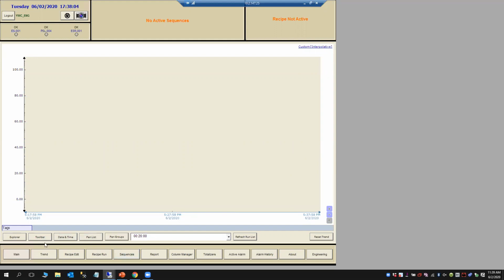So at this point, we will be concluding our presentation on the general overview of recipes, reporting, as well as trending.